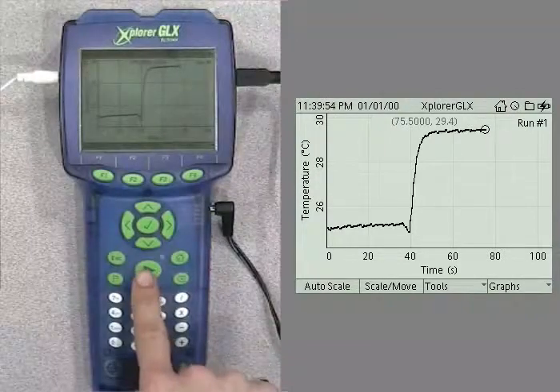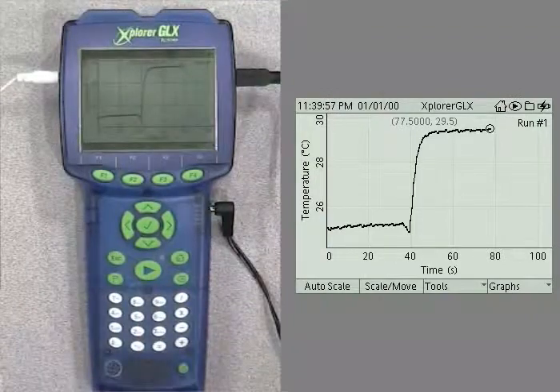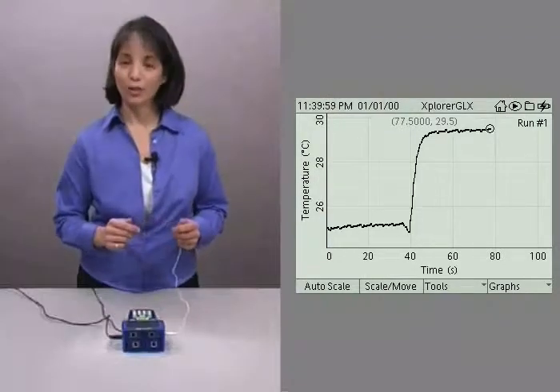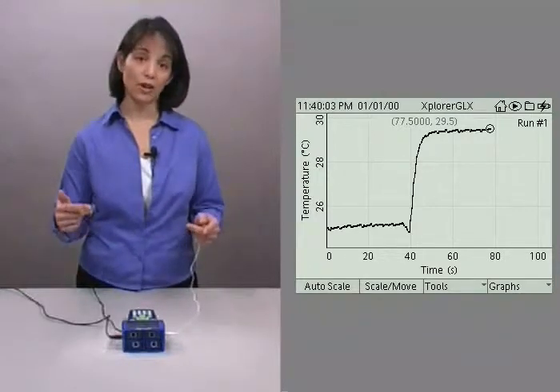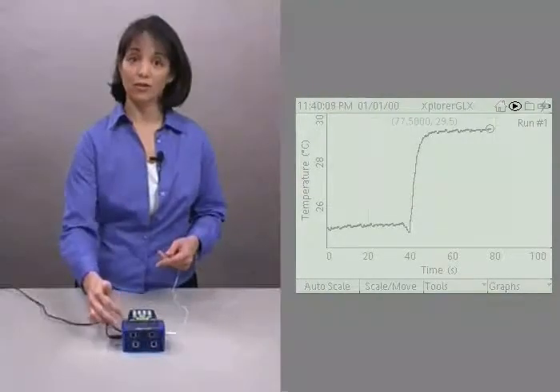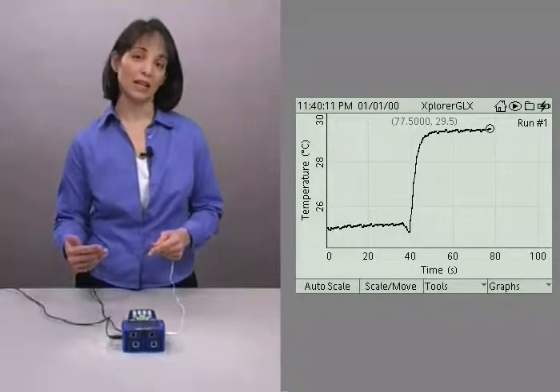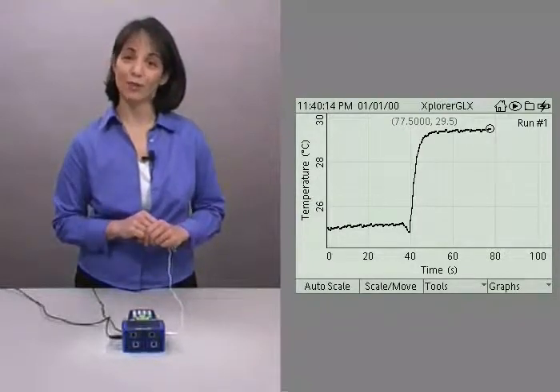Let's go ahead and push the start-stop button again to end data collection. You have just collected your first run of data. Notice on the top bar that our clock has changed back to a picture of the start-stop button indicating that the Explorer GLX is now ready for you to collect another run of data.